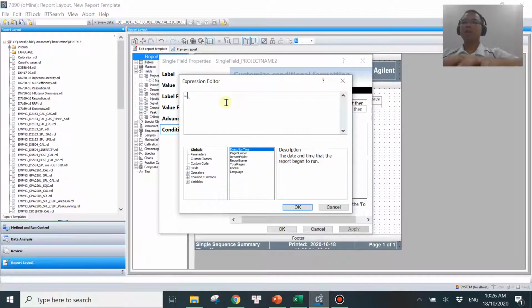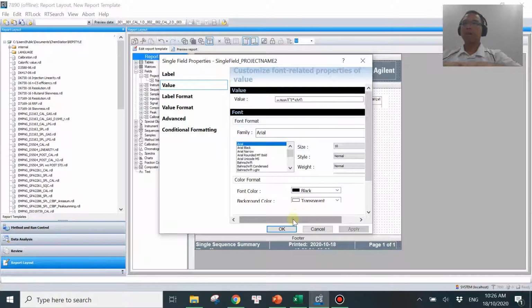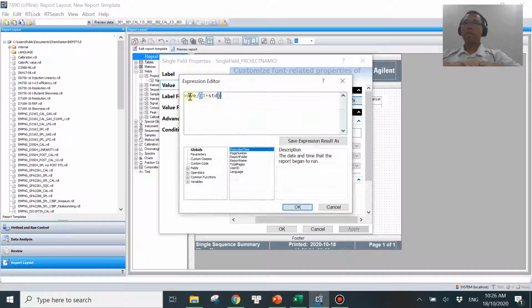So you need to compare, wait, let me cancel that one. So the value over here, the formula is like this. Okay, let me copy the formula so it's easier. There, this is average divided by 3 standard deviation, which is the LOD formula over here.